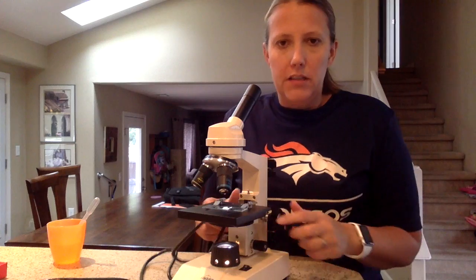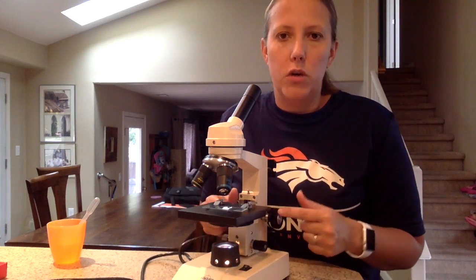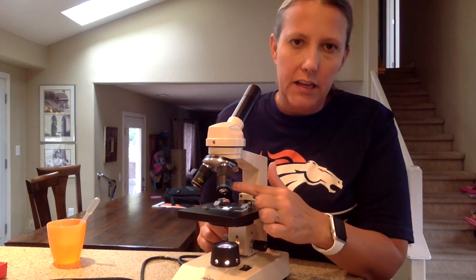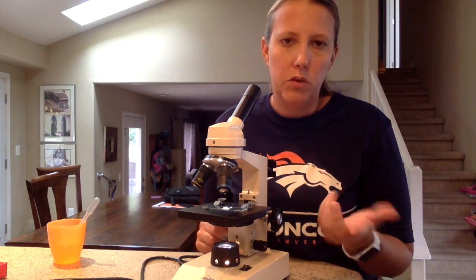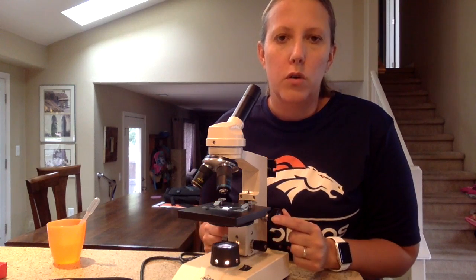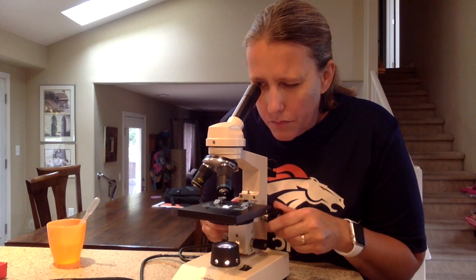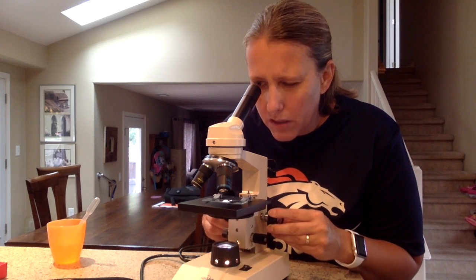With your stage all the way down, you're going to start turning the coarse focus knob — that's the big focus knob. I always remember: little lens, big knob; big lens, little knob — it's a rule of opposites. So since I'm using the littlest lens, it's safe to use the coarse focus knob. I'm going to look through and focus. I have to look while I'm turning the knob, or I might miss when it comes into focus.